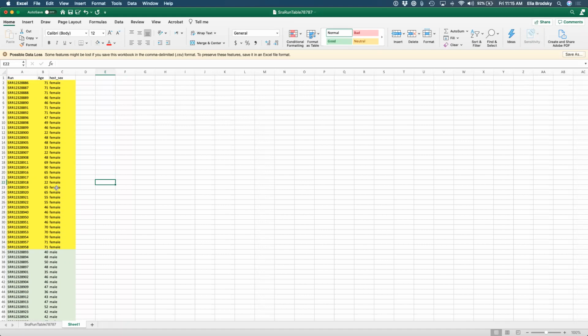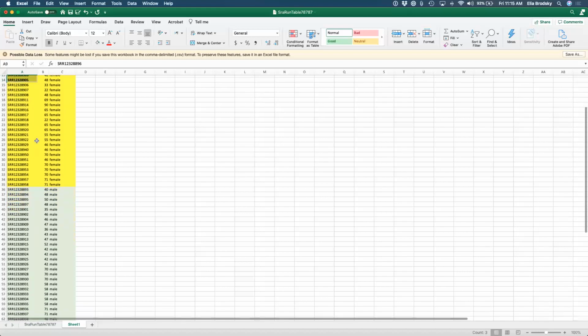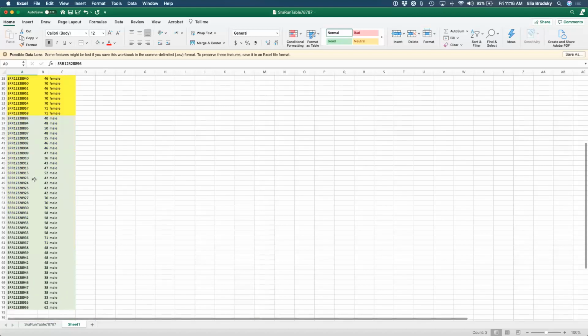All right, excellent. Dr. Barca suggests that we take the same age, right? So here we have older. The oldest is about 70. The youngest is about 20. Probably want to have some average. Looks like maybe 48 might be the average. So let's take these three. So we have female right here, right? So I'm going to select these two and maybe another one, 47. Okay, so these I can use for female, and let's find the same approximately from the male.